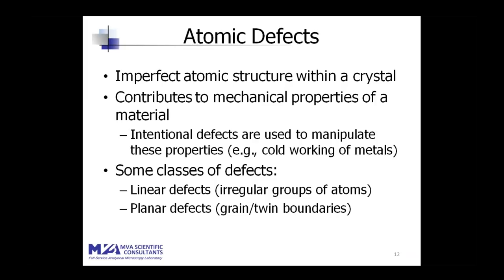Defects are just imperfections in the atomic structure within a crystal, within the crystalline lattice. And this can contribute to mechanical properties of a material. And in some cases, these are intentional and they're used to manipulate the properties of that crystal, of that material.